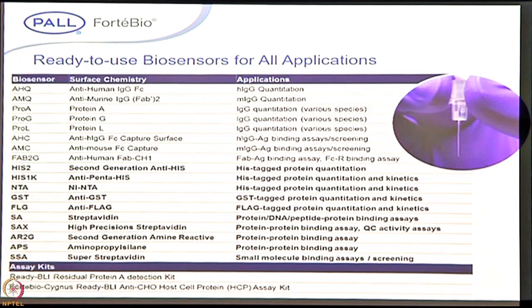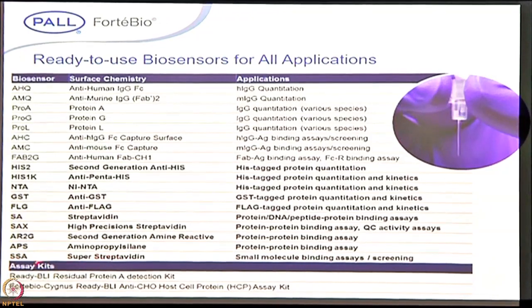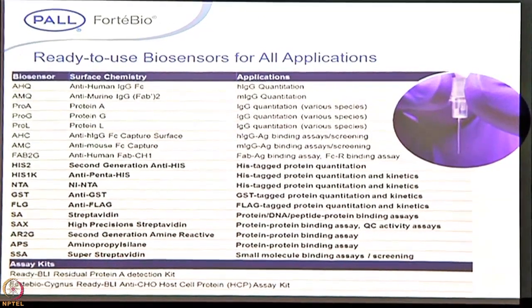We have APS sensors, aminopropylsilane, for hydrophobic interaction. If your protein is more hydrophobic, there is no need for any tag or anything, you can just bind the protein of interest on that. And for the super streptavidin, this is a quartz-based sensor specially for small molecule protein interactions.